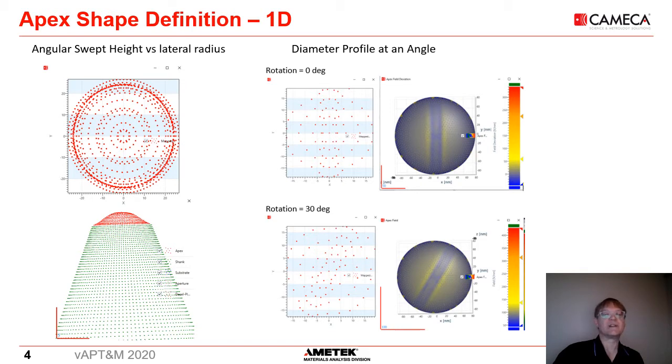We had previously discussed the idea of reconstructing to an equilibrium apex that can be built using the software, or if desired, a spherical apex, but now trajectories will be propagated through a simulated electric field, rather than following a point projection model. We now have a few different ways that a non-uniform apex shape, or rather a set of shapes, can be defined for a reconstruction.